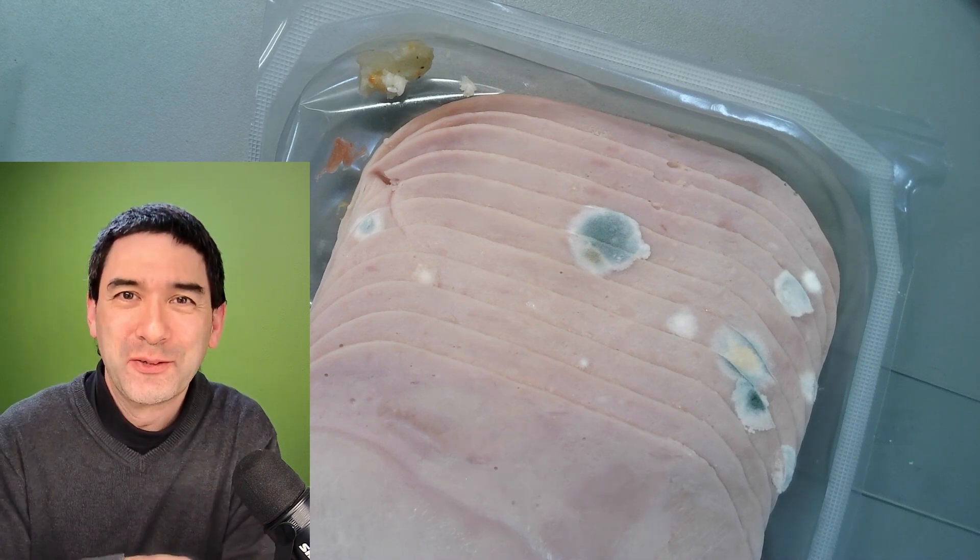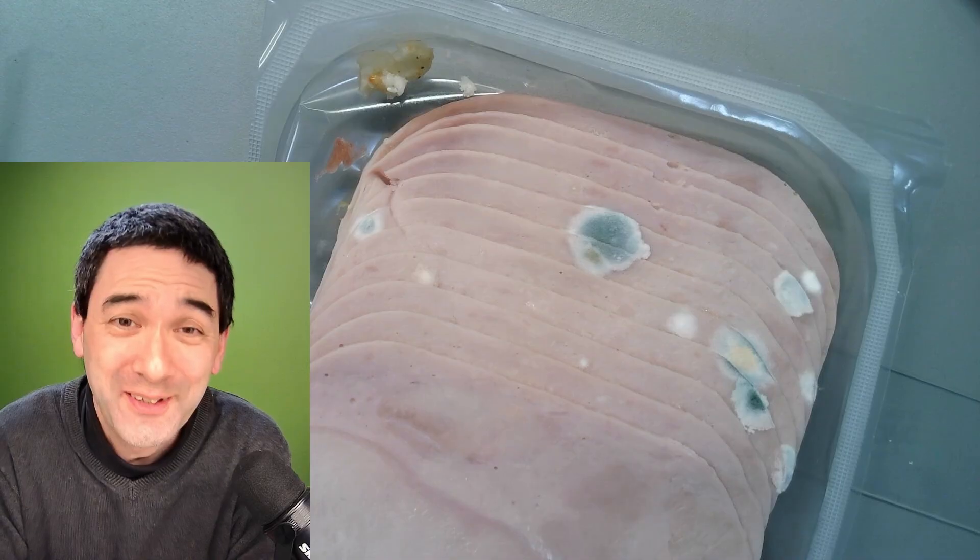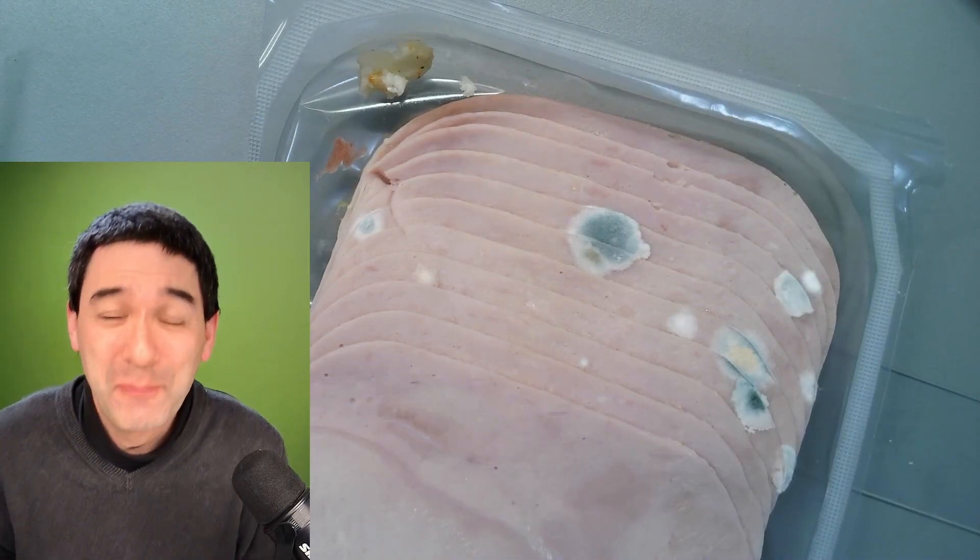Hello and welcome again. Microbe Hunter here, I'm Oliver. Look what I found in my fridge the other day. Isn't this beautiful? Some ham.